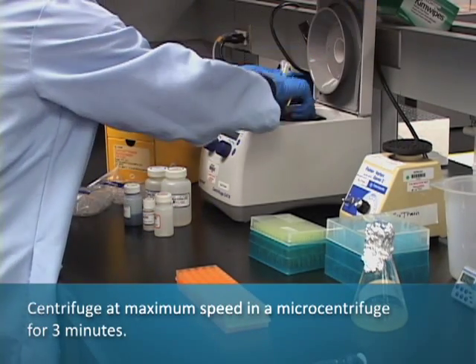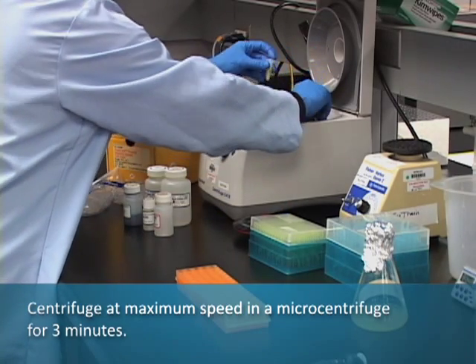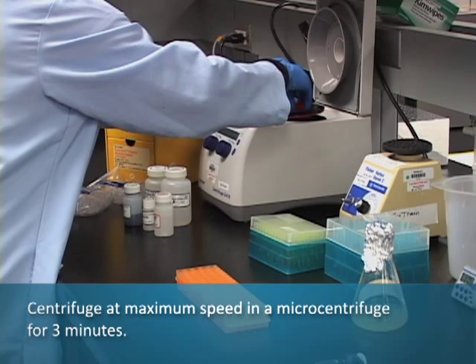Centrifuge at maximum speed in a microcentrifuge for 3 minutes. While the centrifuge is in operation, assemble the Pure Yield Mini-Column.